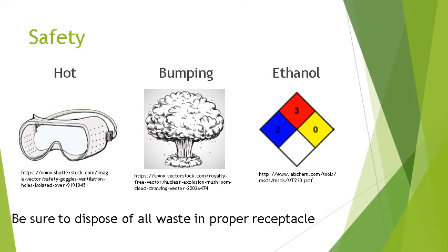Ethanol is flammable and can cause skin and eye irritation. If ingested, it can cause internal organ damage. It is important to dispose of all waste in the proper receptacles during this lab.